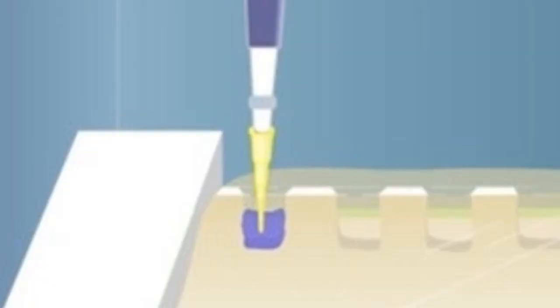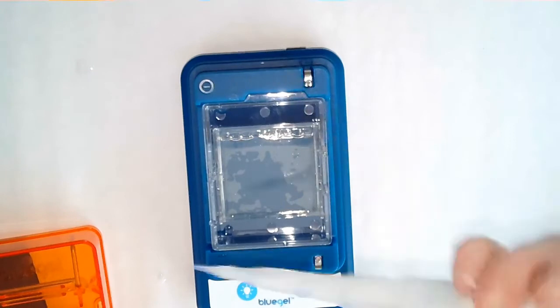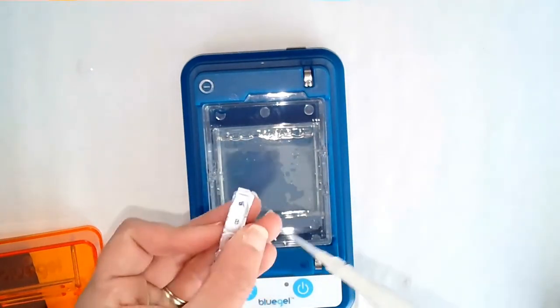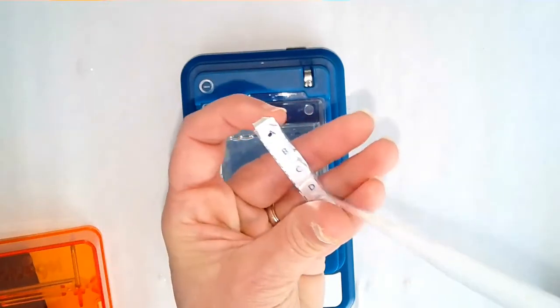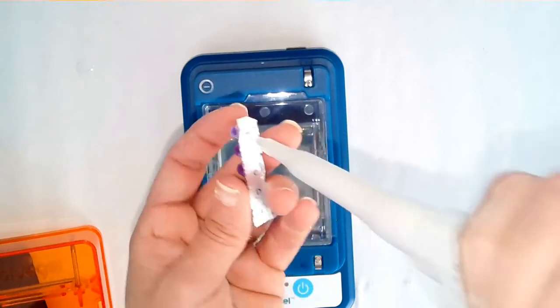When you transfer the DNA sample to the wells, it's important to go just inside the well. Don't puncture the well. Okay, you have a fresh tip. You're set to 10 microliters. I'm person A. I've been assigned to DNA A. Do not remove the foil. You simply puncture your pipette tip through.